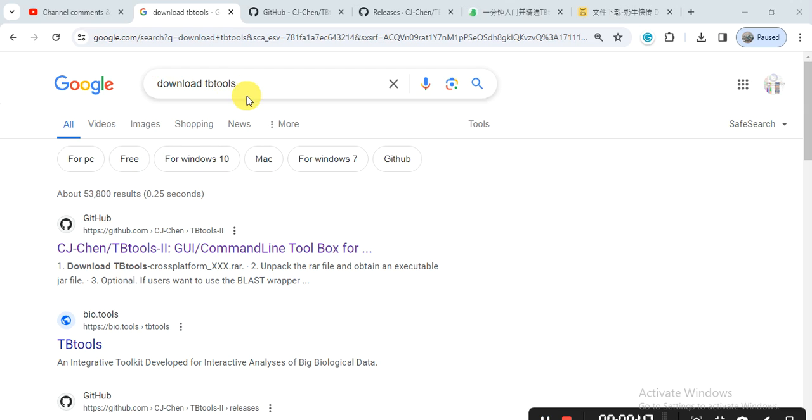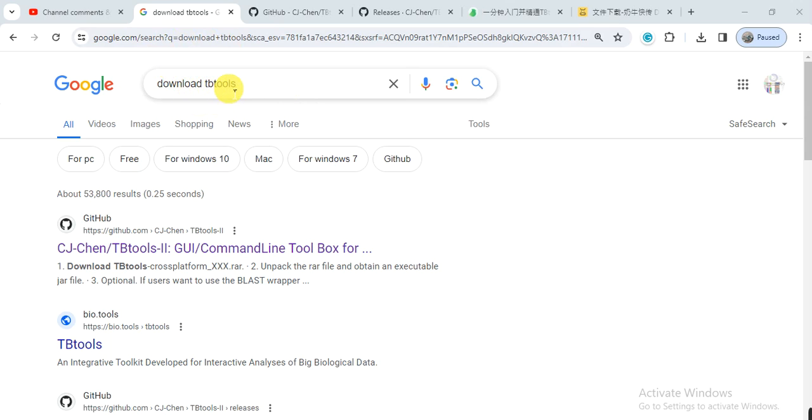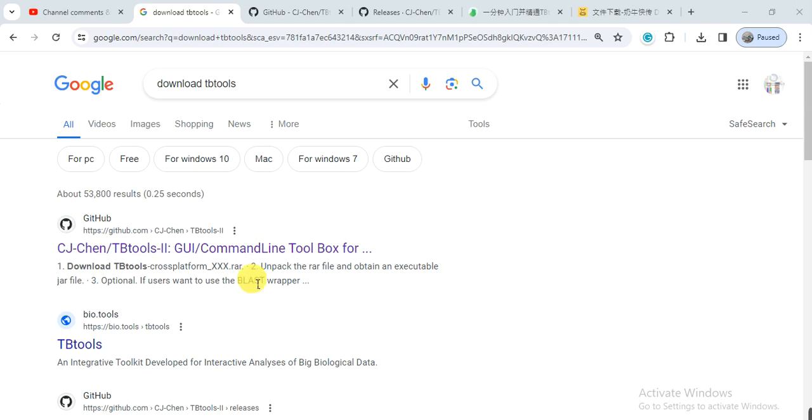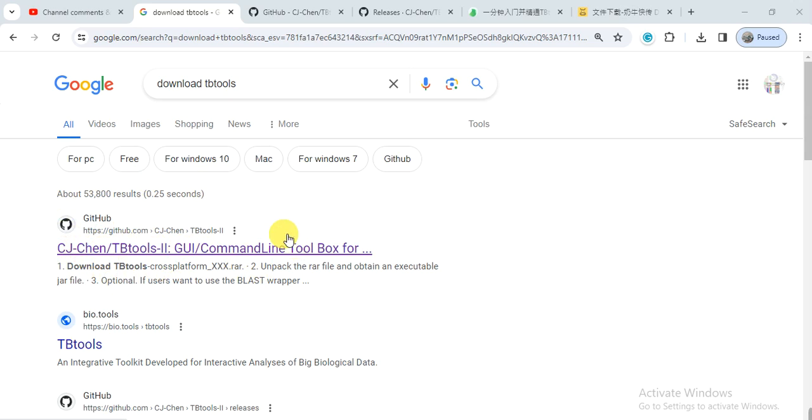Open Google or any search engine that you are using and then write 'download TBtools'. Then open this first web link that is github.com. You can right-click and open the link, and it will guide you to this page.